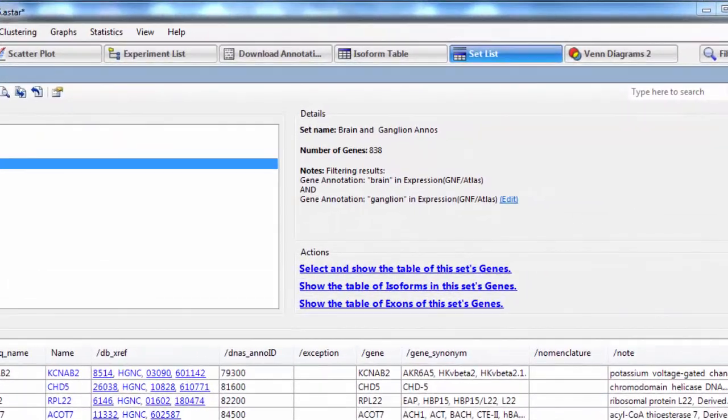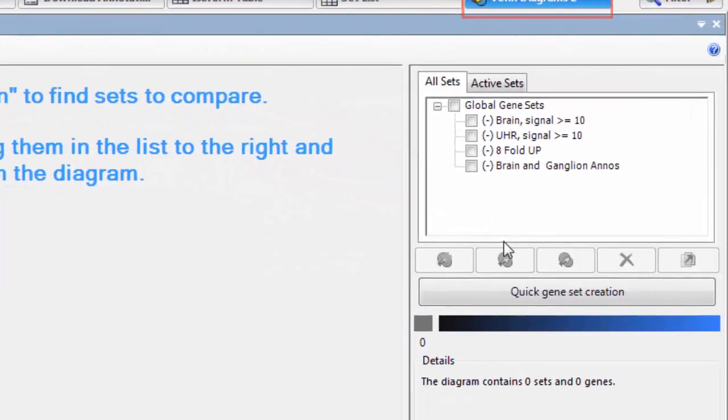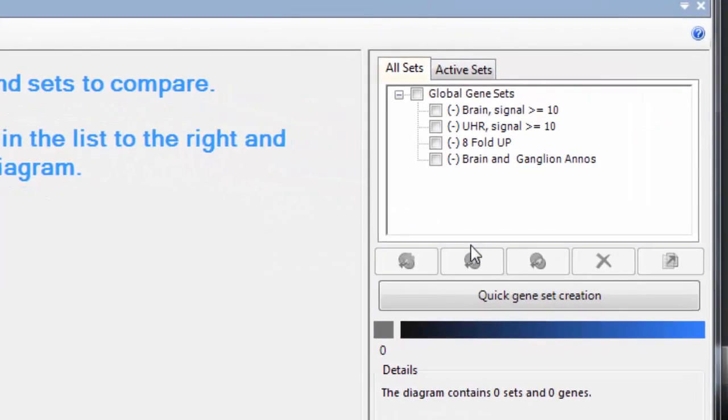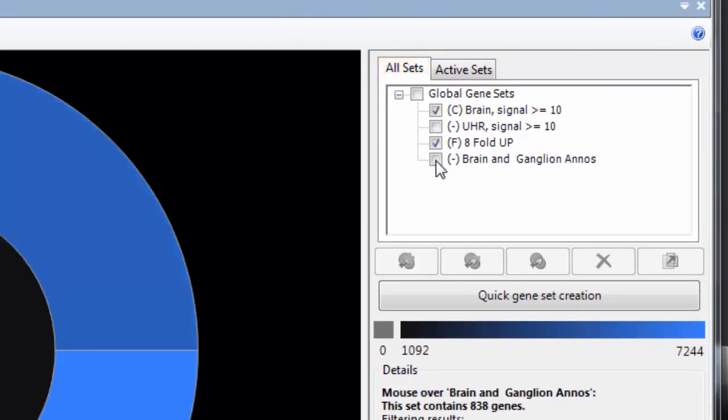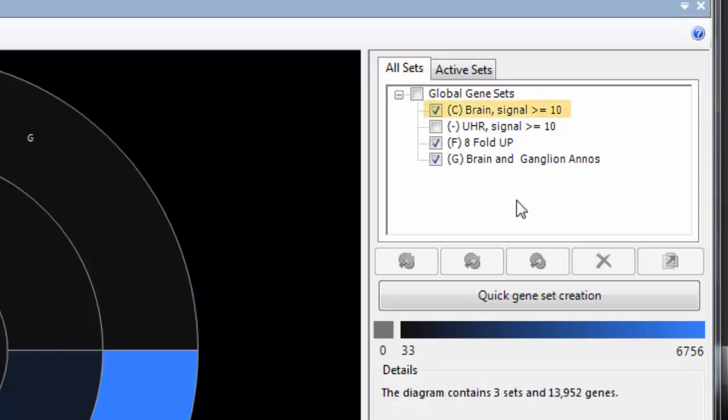Now I'll return to the Venn diagram view. And from the all sets list, select three of my gene sets: the genes in the brain sample with a signal greater than or equal to 10, the 8-fold change genes, and the genes with the gene expression annotations we searched for.